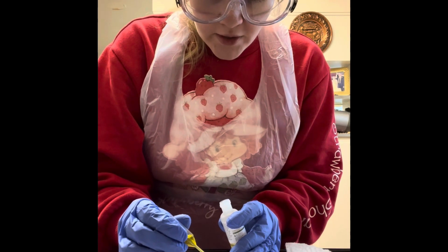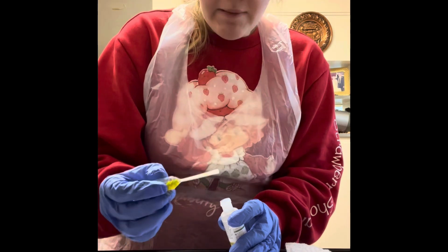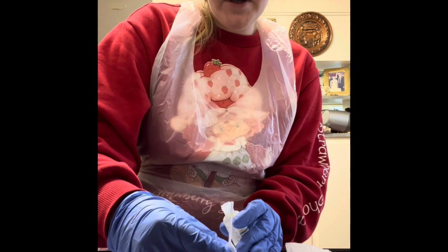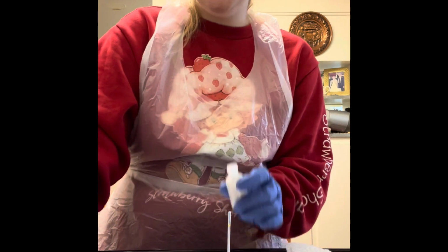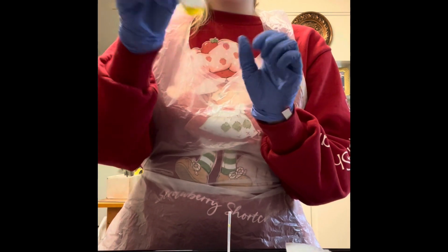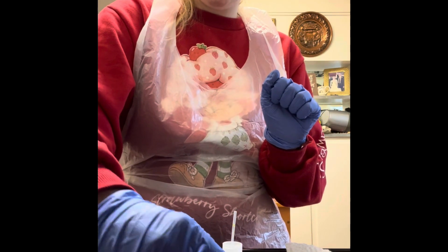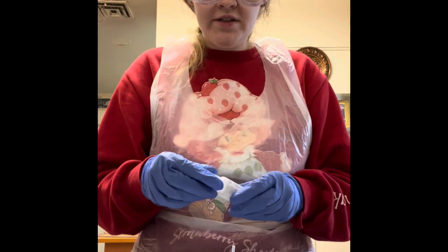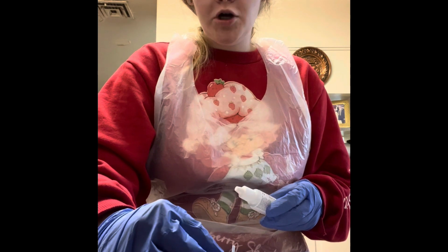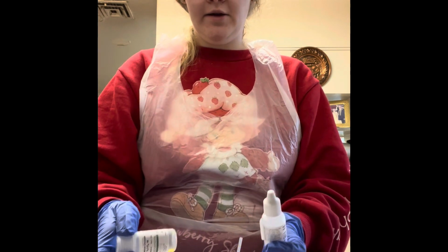1, 2, 3, 4, 5, 6, 7, 8. And I'm actually going to put the pipette directly behind where I have put the 8 drops of potassium chromate. So I've just recorded the color of the potassium chromate, which is yellow. You can see that from here, it's yellow.